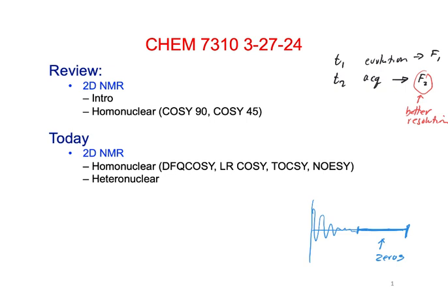Or exponential is another one, because I remember we used to have to type FT, what was it? There were 3 different commands. But I think that we usually did an exponential calculation. But if you change it to the Gaussian, there are some values that you can change in there, so you can optimize the peak shape as well. So I think there's a lot of things you can learn like that.